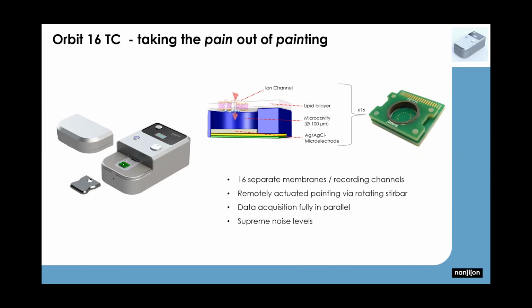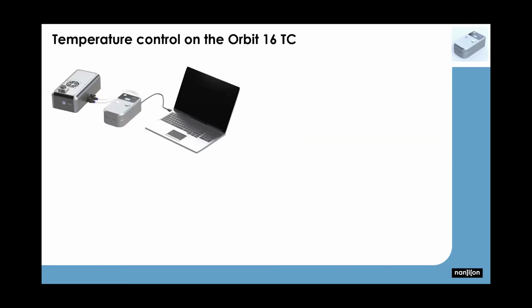And in the MECA 16 chips, you would actually have 16 of these cavities that are all spanned by individual bilayers just at the push of a button. And we did the same proof of concept for this device as well. So this is how the whole setup would look.